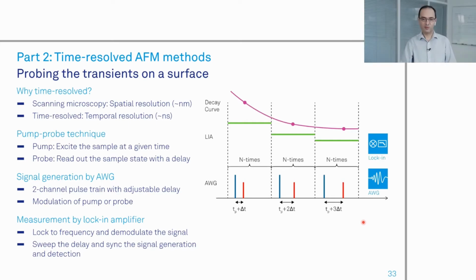Thank you very much, Roman, for this nice presentation and also the AFM demonstration. Hello, everyone. I'm Mehdi, and welcome to the second part of this webinar, which will be, by the way, shorter than the first part. So here we focus on the time-resolved method for AFM applications.